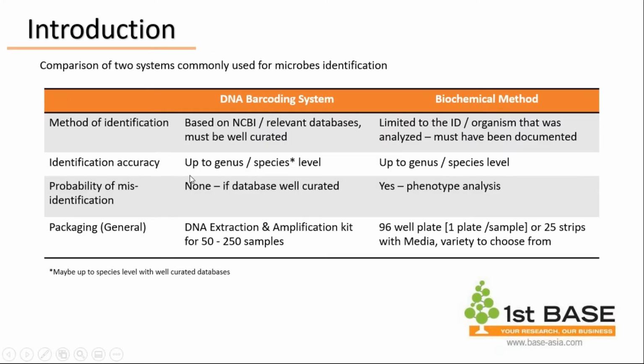Both systems are accurate up to genus and species level.